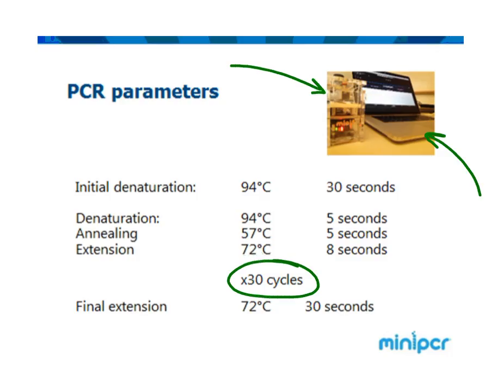So, one thing I want to mention, I'll mention in class, but I want to mention it here too, that we're approaching 200 degrees Fahrenheit right there. Here, 160. This, about 140. So, I mean, hot. Understand that the computer is going to say the lid is hot, so don't touch it, because it's mainly the lid part that's going to get hot, because that's where the heat block is in the thermocycler. So be careful you don't burn yourself on the thermocycler, okay? So be mindful of that.